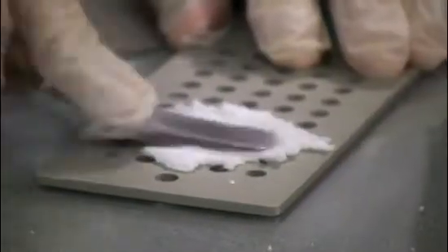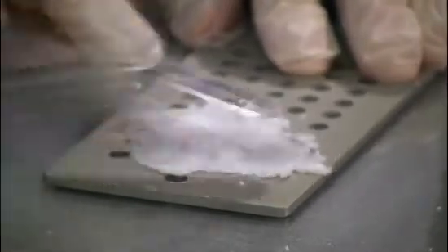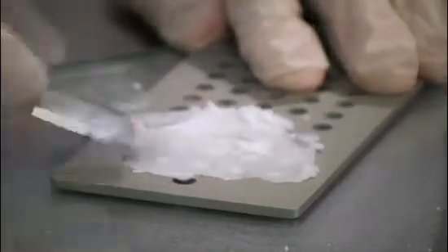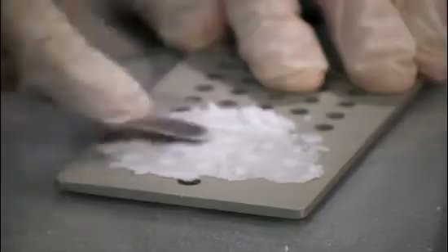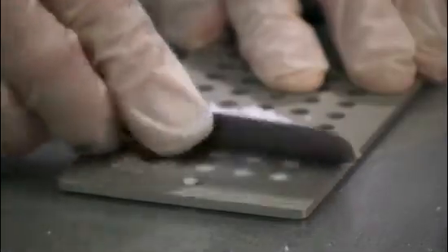Take a spatula and move the mass over several rows of cavities. Then come back and focus on one row at a time. You'll notice that my index finger is down on the spatula toward the very end. I am attempting to apply as much pressure as I can.